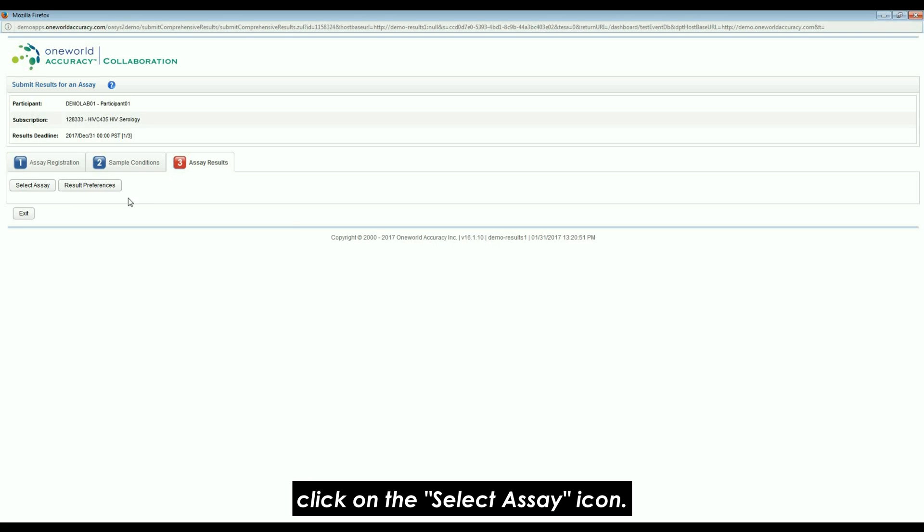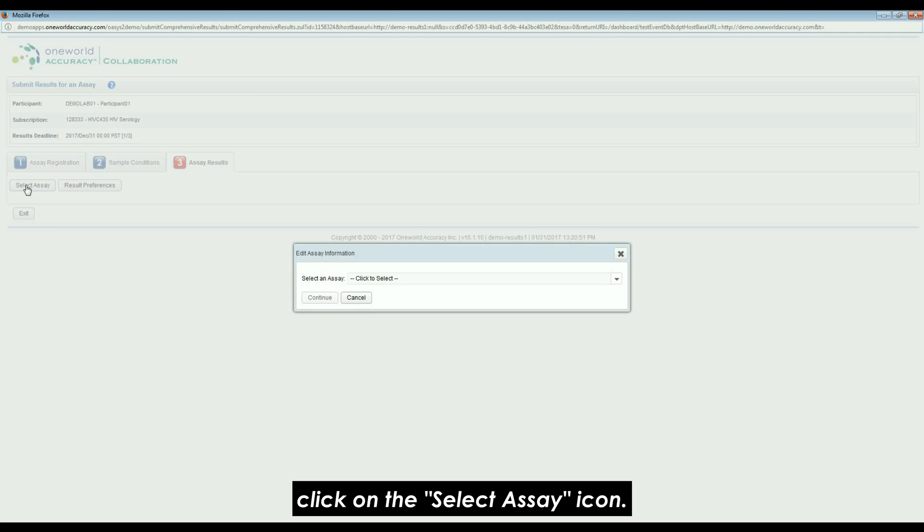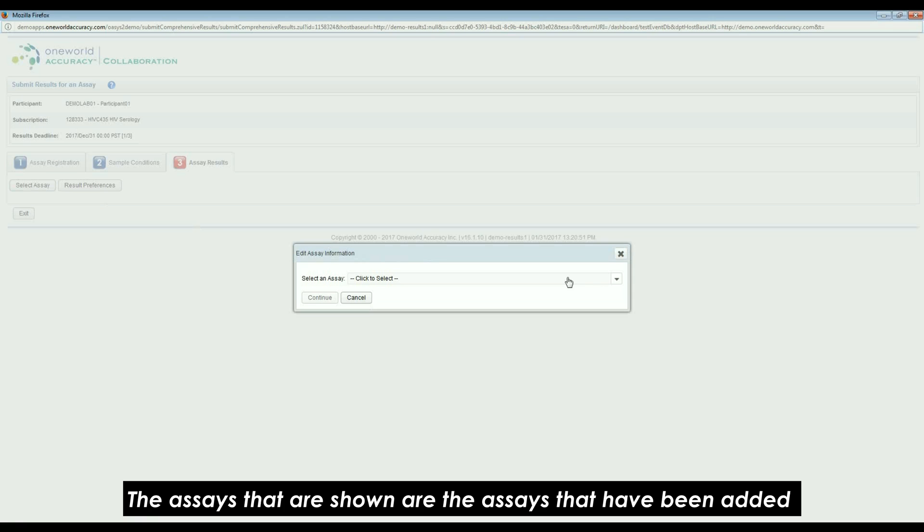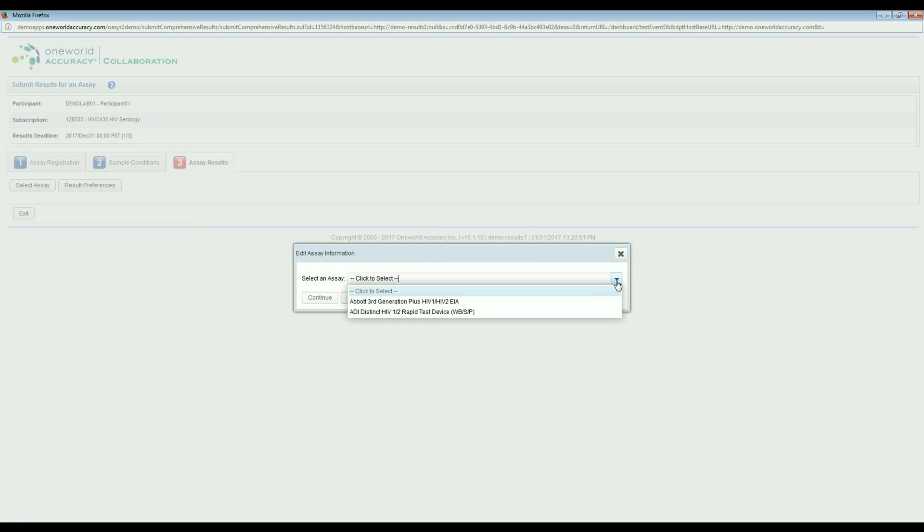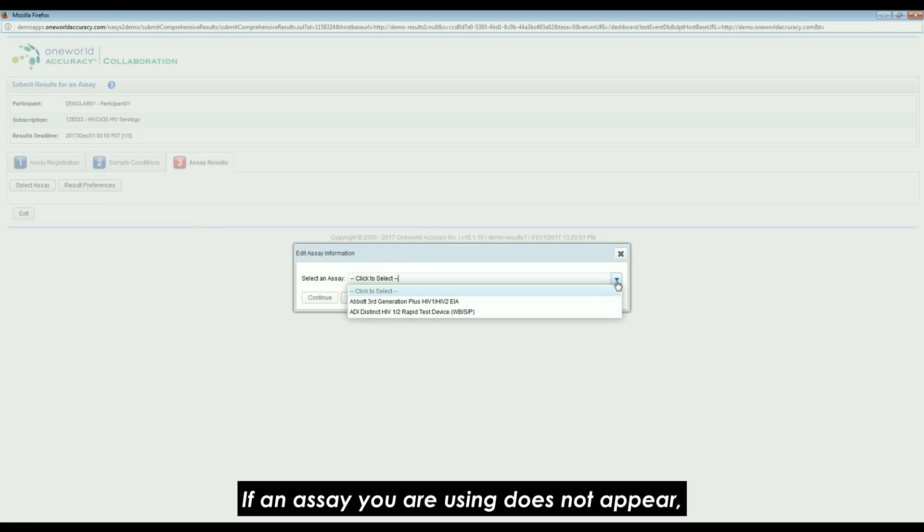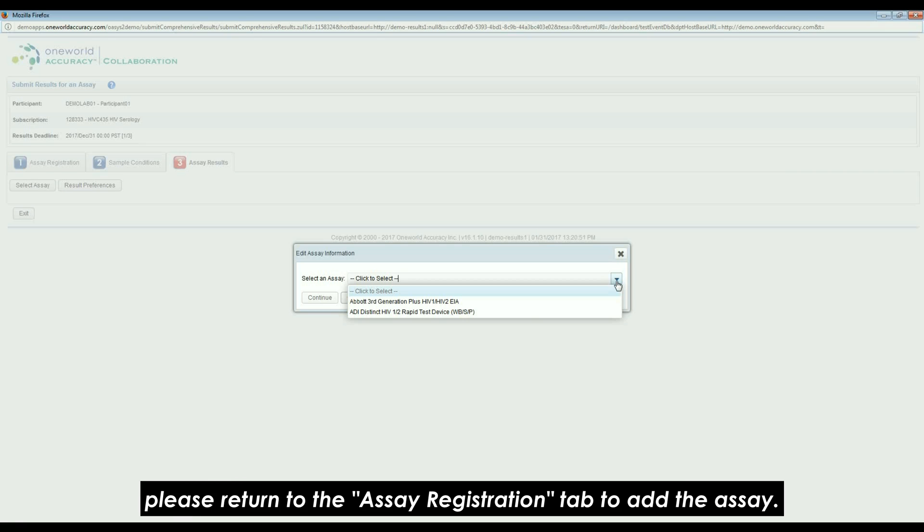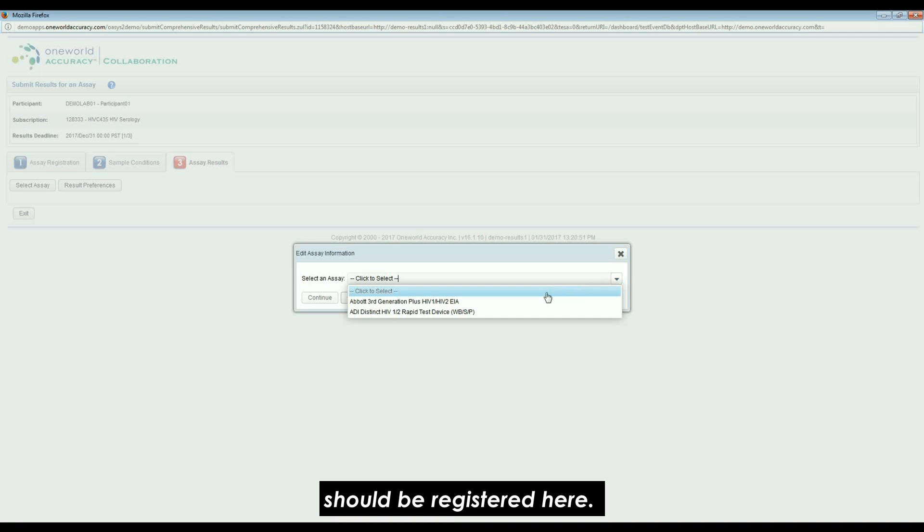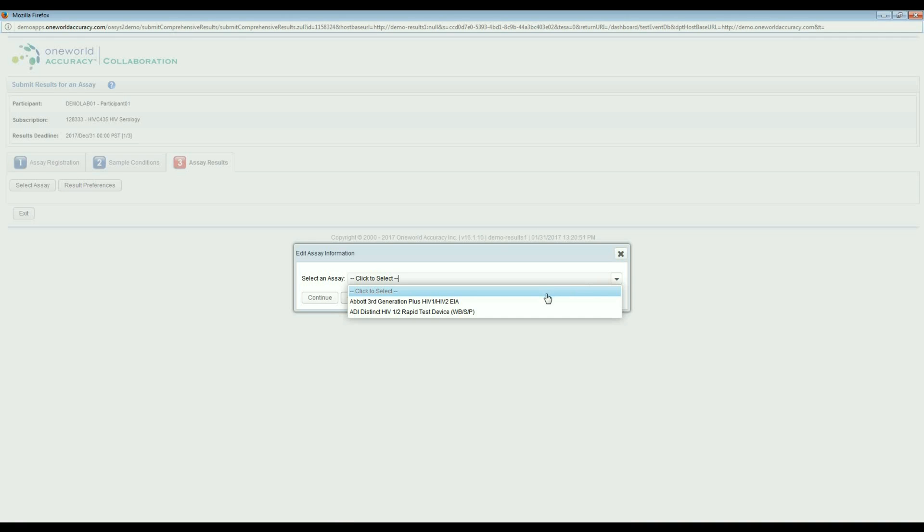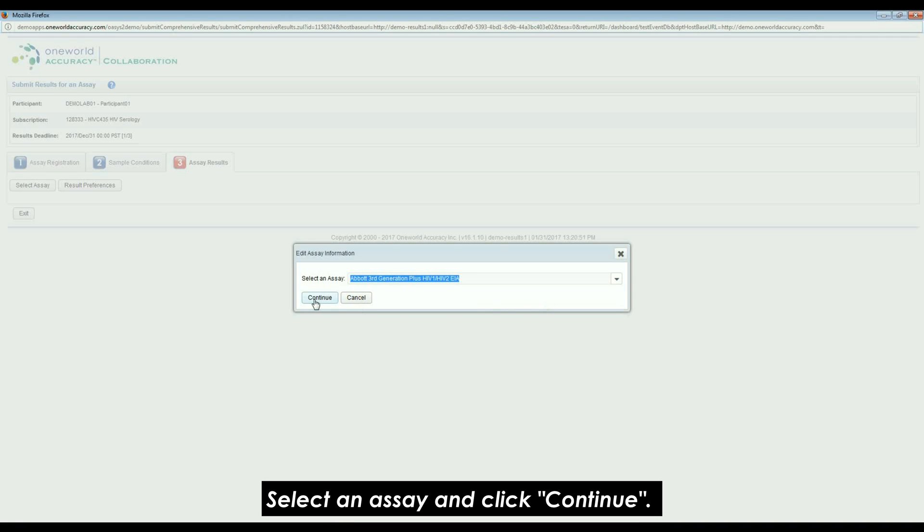Click on the Select Assay icon. The assays that are shown are the assays that have been added in the Assay Registration tab. If an assay you are using does not appear, please return to the Assay Registration tab to add the assay. Please note that all assays you are using for all test processes should be registered here. Select an assay and click Continue.